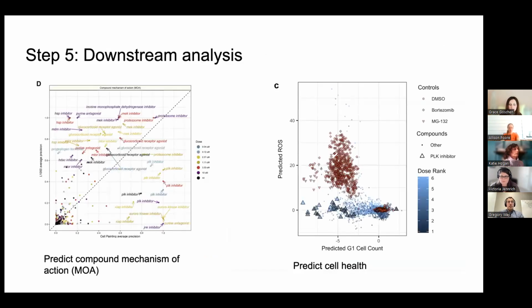So there's lots of things that you can do now that you have. So yeah, let me take one step back. I've talked about where the lab is butting up against state of the art. Now just considering the canonical pipeline where you take all of the single cells and you aggregate them together, so you form one data point per image, and you're just focused on that and also CellProfiler features. Now we're back to that realm. If I have time, I'm going to talk through one application, which is a drug screen that we performed during my postdoc.